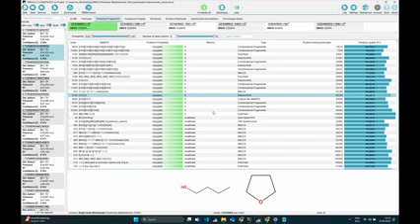So do you have any values that are reasonable to get in relation to the CSI score? You say it is close to 0, it's better, but sometimes it has different values like -6, -80, -150. Is there a rule or any suggestion in relation to this question?